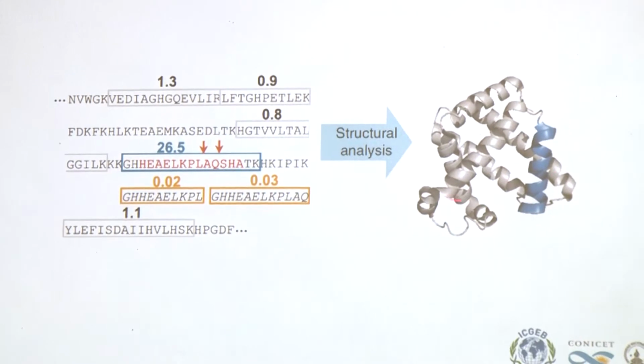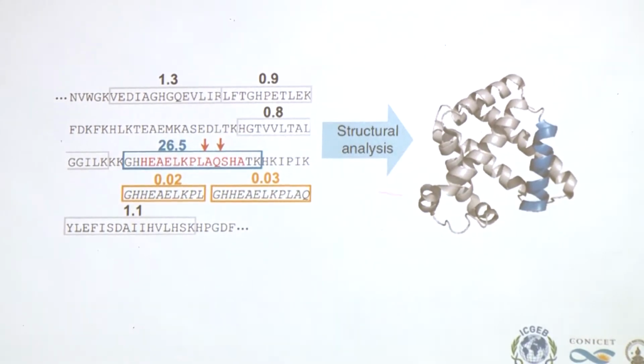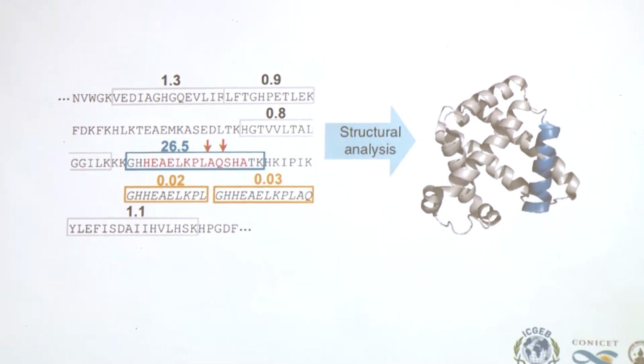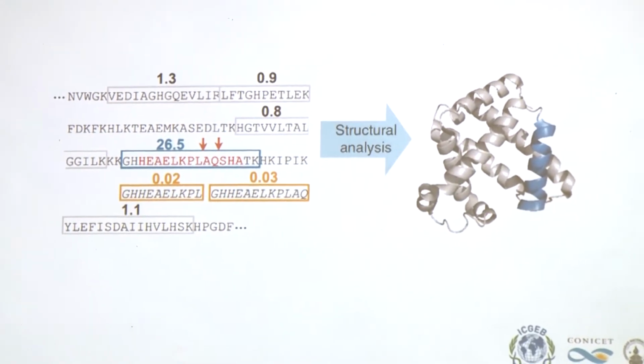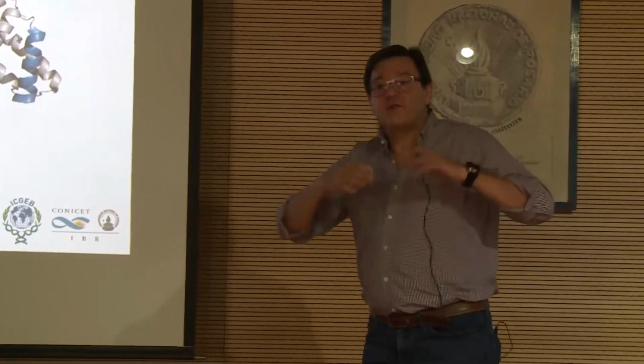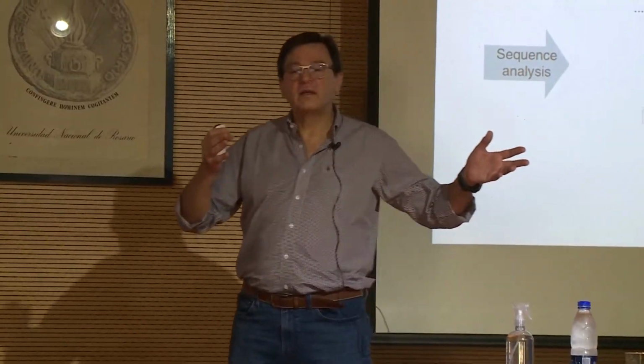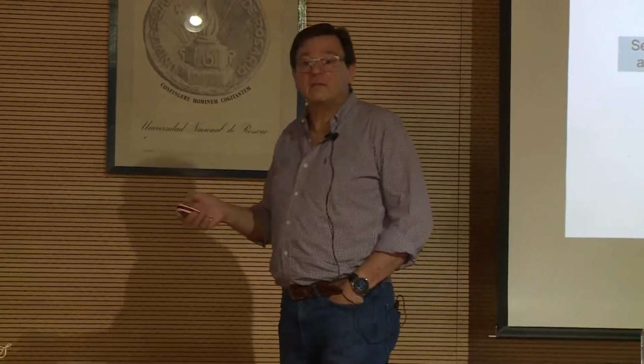So in this case, you have two peptides generated by the proteolysis of proteinase K that allow you to identify and differentiate the myoglobin with the heme bound from the protein that is not with the heme bound.